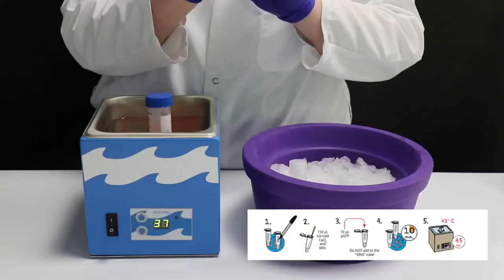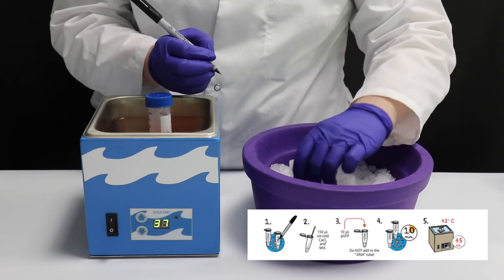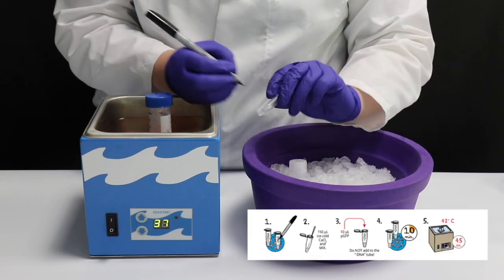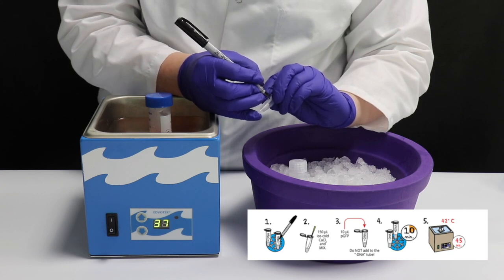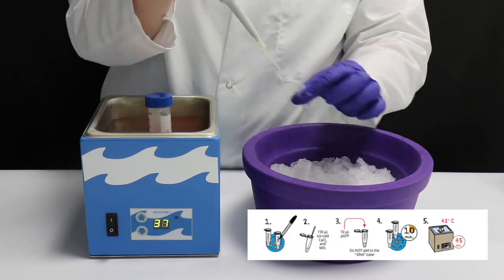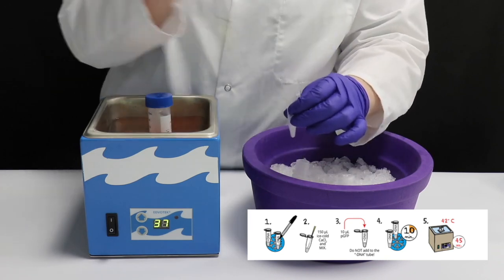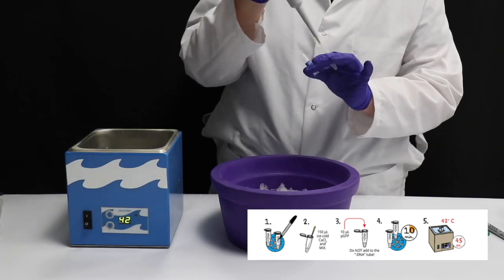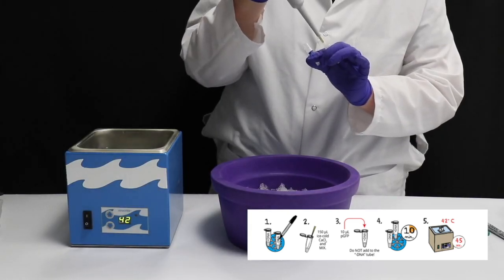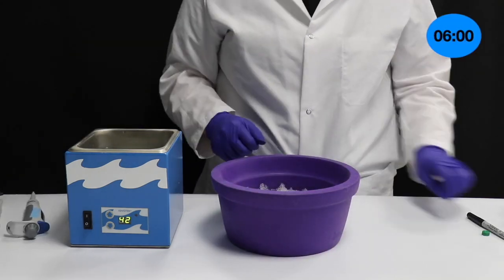Step 4: Transformation. Label one tube plus DNA and the other minus DNA. Add 150 microliters of ice-cold calcium chloride solution to each of the tubes and mix by pipetting up and down. To the plus DNA tube, add 10 microliters of the plasmid DNA. Incubate the tubes on ice for 10 minutes.